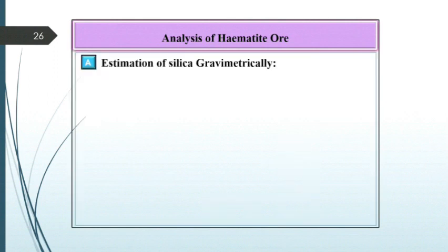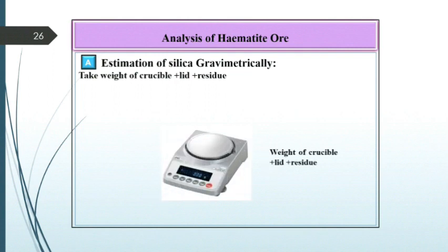Now take the weight of this silica crucible plus lid with residue and record this reading as W2 gram.